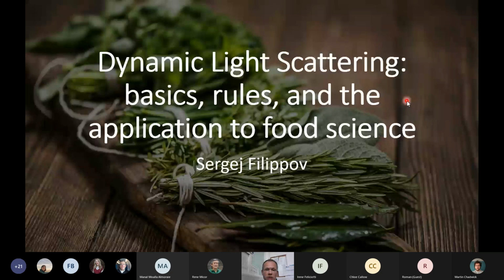The name of this method probably you've heard before this talk. It's dynamic light scattering, and my talk will be organized in three parts. I will give a very brief, very basic introduction to the method, and I will explain how this method could be applicable to the investigation of food science, and I will also share with you some hints how to make a decent dynamic light scattering experiment with your samples.